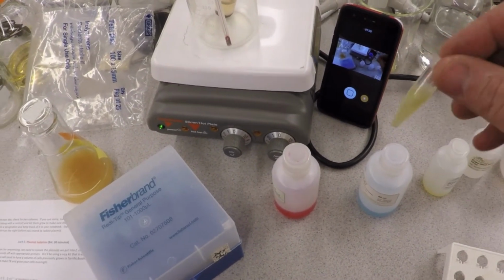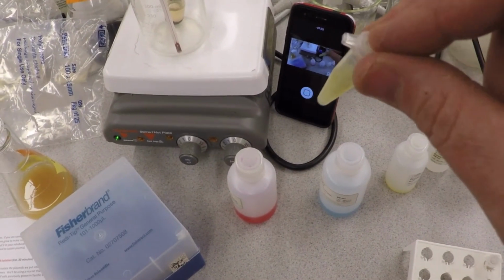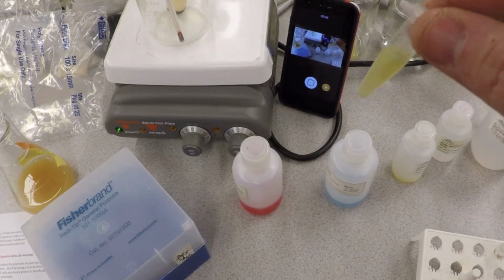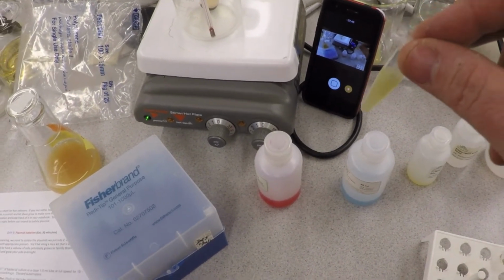And that renaturation process is such that the genomic DNA is so big it won't renature, it turns into all this flocculent garbage. But the little plasmids are small enough and they will renature and come back together into a little circle. Okay? So now it says incubate at room temperature 1 to 2 minutes. So we'll do that.